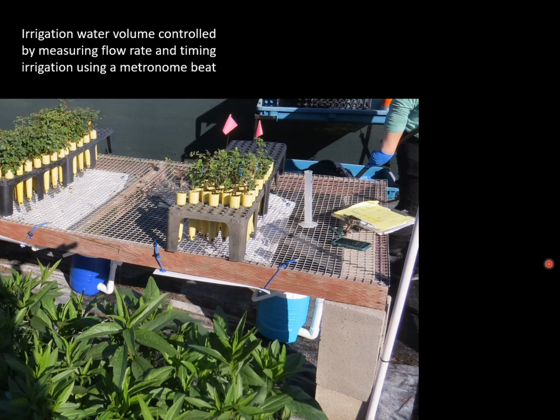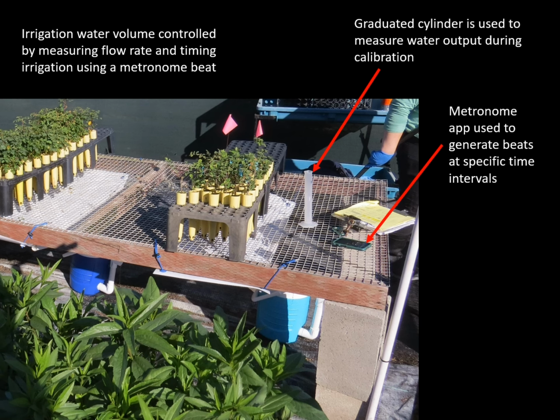So really all we need to do this with is the graduated cylinder, some other volumetric equipment that's scaled to the size of the pots we're using. And we also need a metronome, and you can just download a metronome app, put it on your phone and use that.